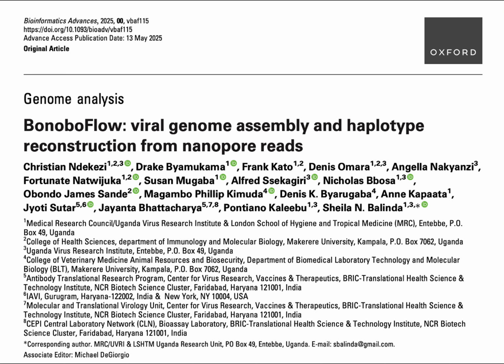We call those indels, and single nucleotide changes, SNPs. Right. For researchers, these errors created a big hurdle. It made it really tough to accurately reconstruct the true biological genetic variation they were seeing. Distinguishing real variation from sequencing noise was hard. So great for getting the length, but the raw data itself was a bit messy. Noisy. Precisely. Noisy is a good word for it.